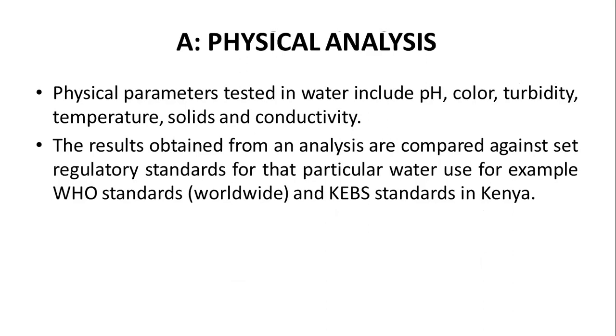So, physical analysis. For this, I'll be taking you through the following parameters: pH, color, turbidity, temperature, solids, and conductivity. After conducting your analysis, you usually compare your results with the WHO standards and the regulatory body in your country. For example, here in Kenya, we have the Kenya Bureau of Standards that provides standards for drinking water. Next.